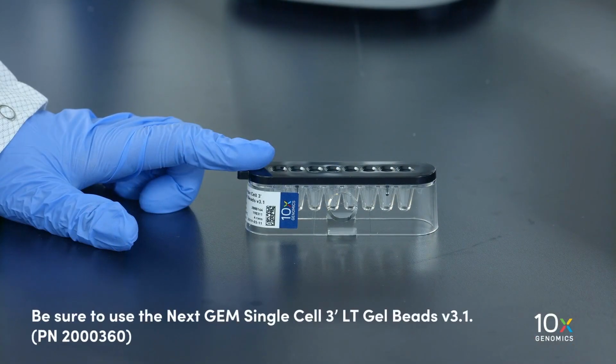We have our single cell suspension and our master mix on ice. We also have our gel beads, which have been equilibrated to room temperature for at least 30 minutes. We are now ready to assemble the chip.